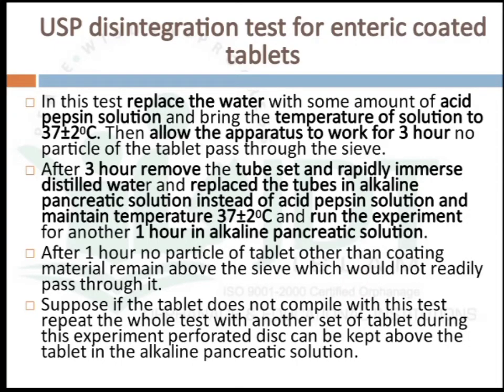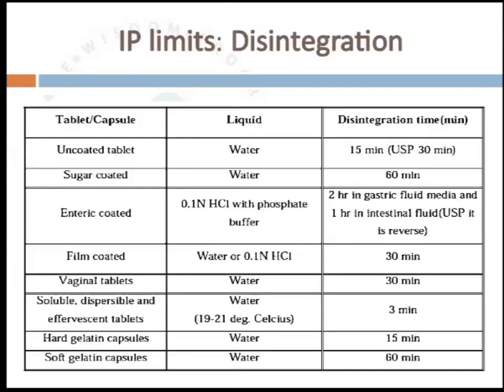Suppose the tablet does not comply with the test, repeat the whole test with another set of tablets. During this experiment, a perforated disc can be kept above the tablet in alkaline pancreatic solution. So these are some Indian pharmacopoeia limits for the disintegration test. An uncoated tablet in water should disintegrate within 15 minutes, but in case of USP it is 30 minutes. And a sugar coated tablet in water should disintegrate within 60 minutes.